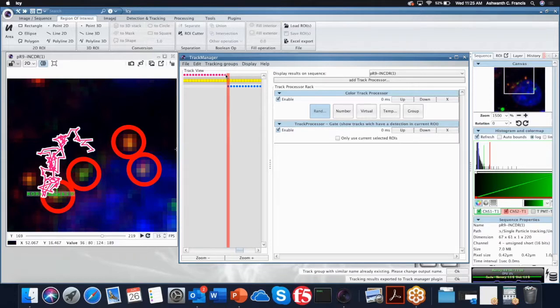So you can actually take the last time of the track and join it with the first time of the second track, okay? By just clicking and drawing a line, right? And now you can go back to edit and say, organize track parent to child. So it's like father and mother, I mean father and son, whatever, right? And then you say fuse all track segments, then you get an entire track of that particle.